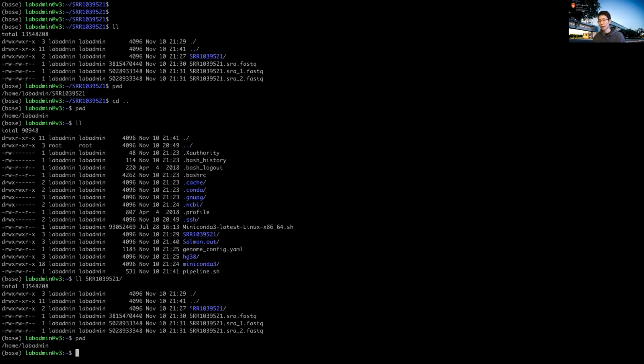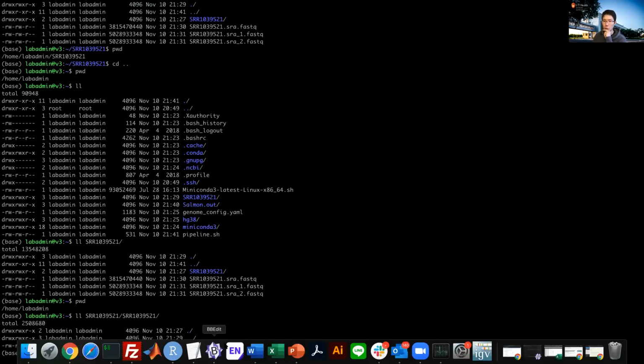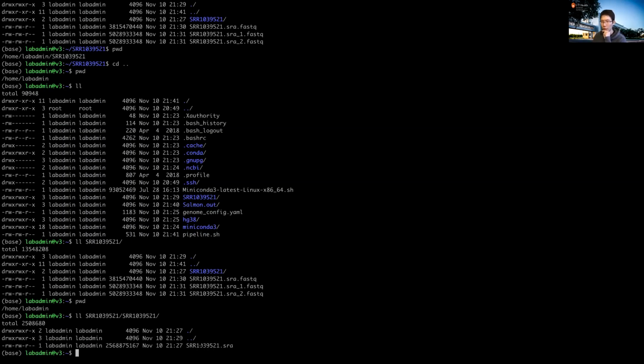And if you want to look at this one, you can do ll and within it, a second directory. So you can list all the contents within the folders. It allows you to do multiple, so you can do the combination. You just type in the path all the way to the folder you want to take a look at, and then do ll to list all the files. Okay, so that's the change of directory.